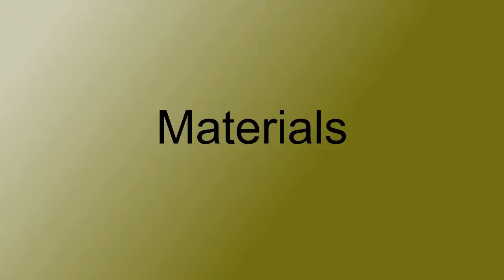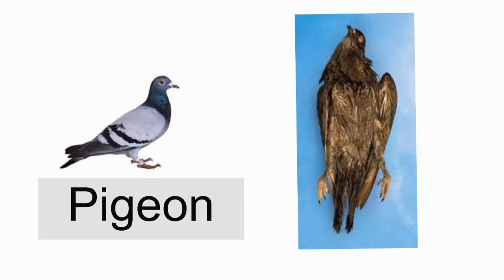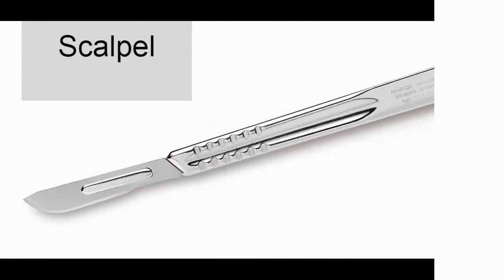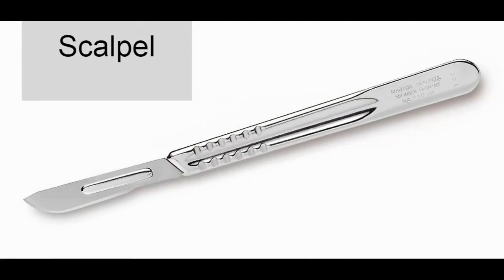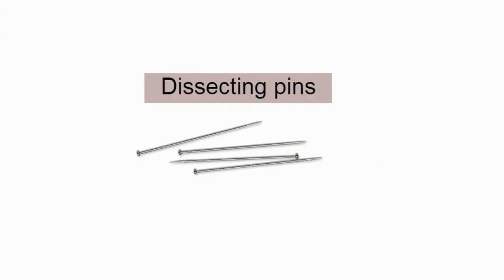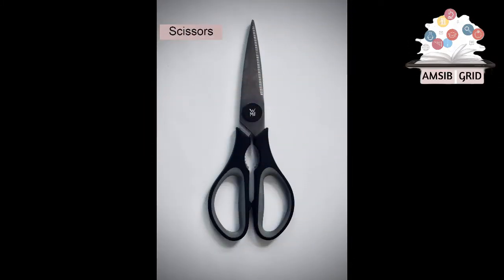Material. Pigeon. Dissecting tray. Scalpel. Forceps. Dissecting pins. Scissors. Probe.